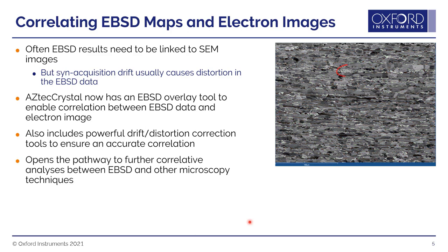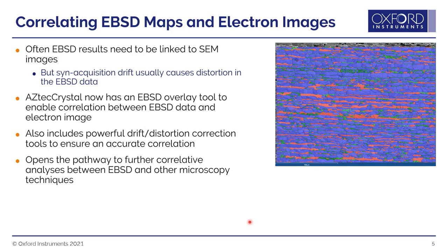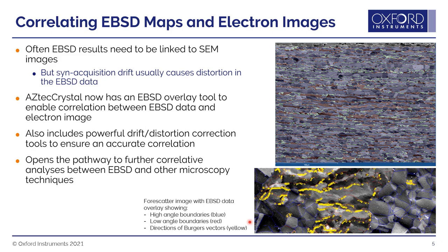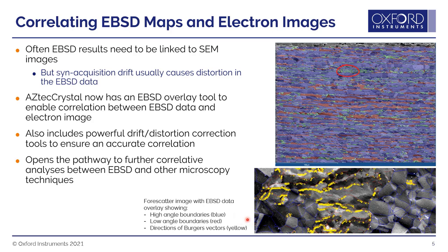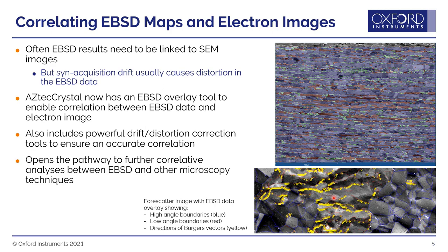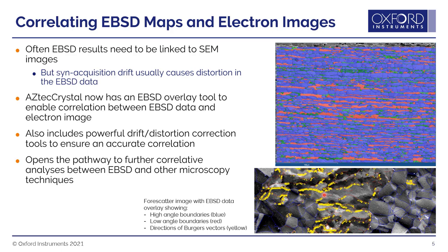This really opens a pathway to further correlative analyses linking EBSD with other microscopy techniques and imaging tools. As an example, this is a recrystallized and deformed nickel superalloy sample. We're looking at a forescatter image with an overlay showing EBSD boundary data — high angle boundaries in blue, low angle boundaries in red — and plotting the directions of the Burgers vectors using yellow arrows. This allows a powerful correlative approach combining EBSD and microscopy.